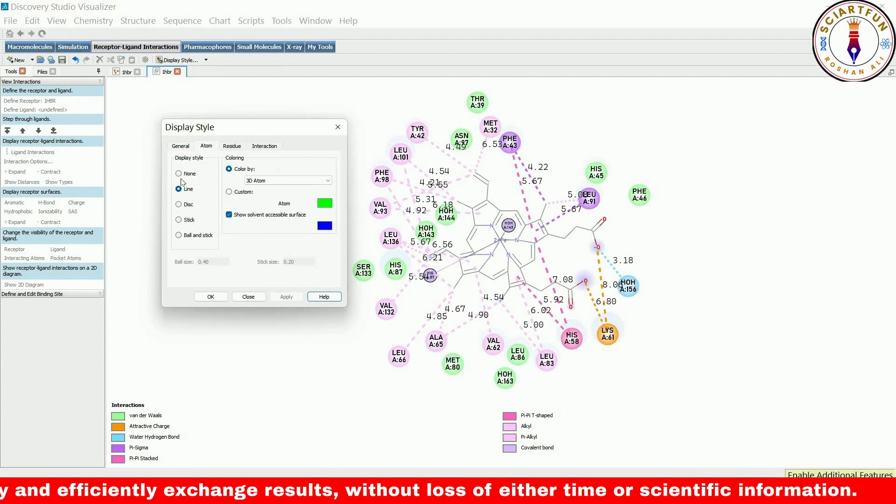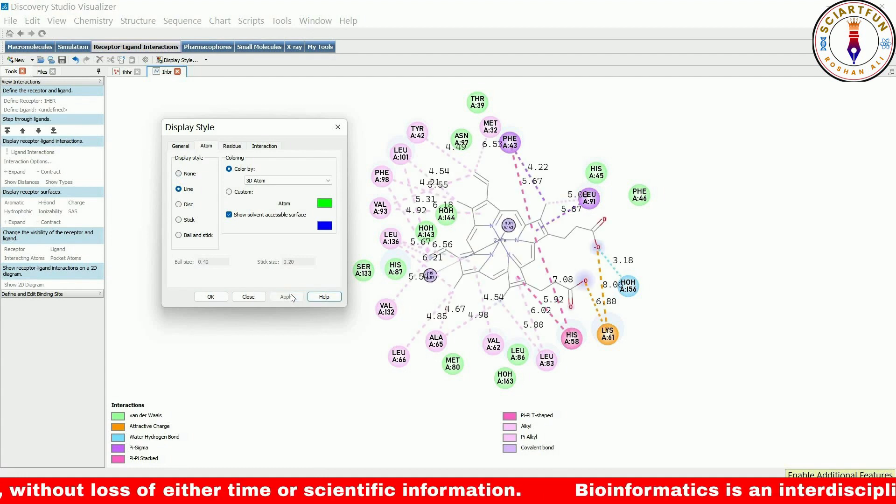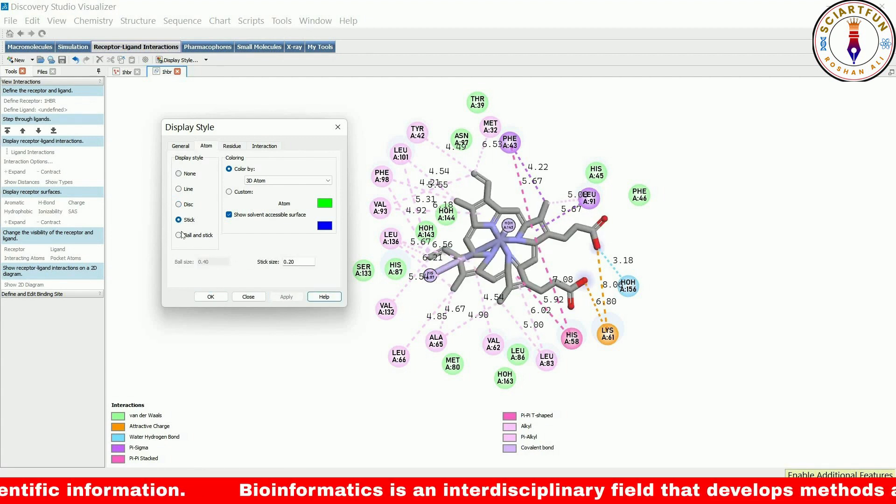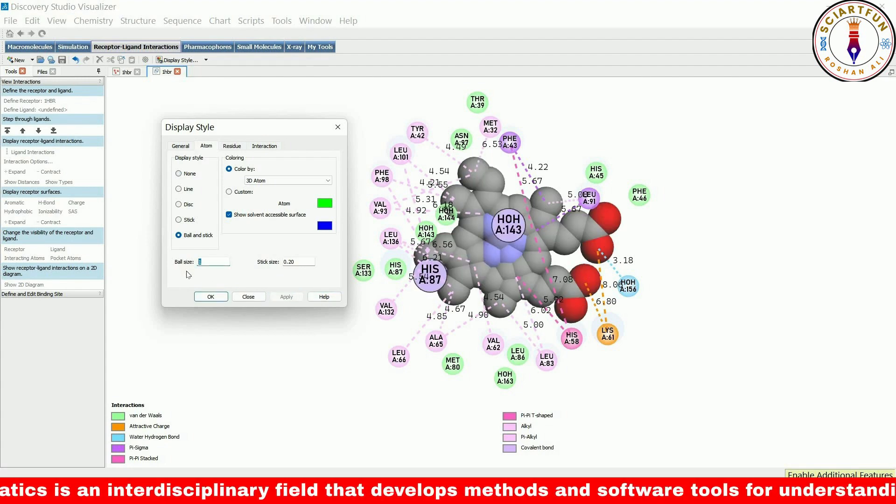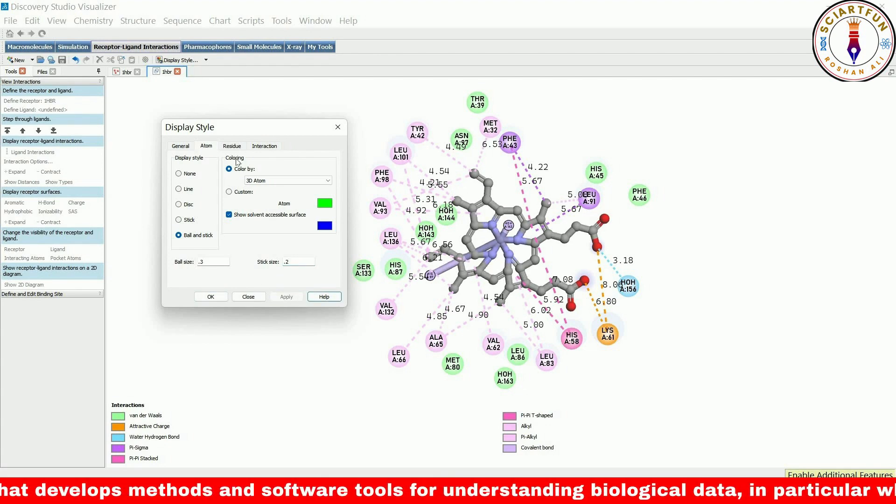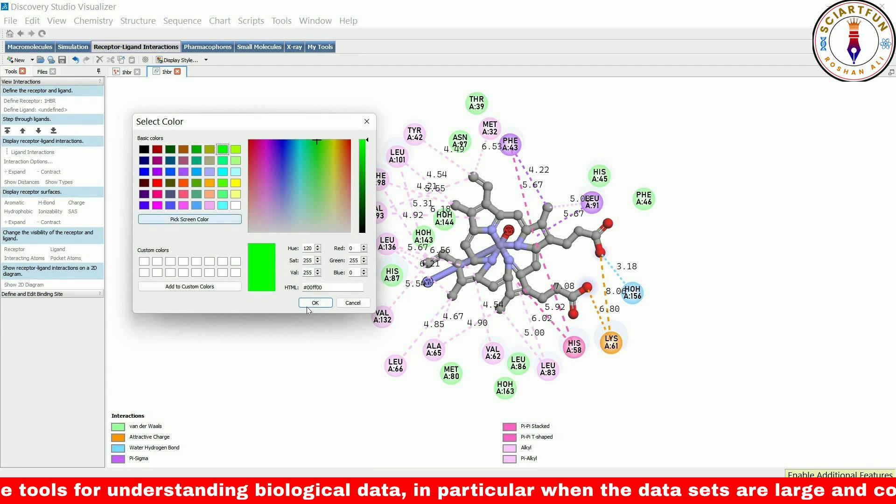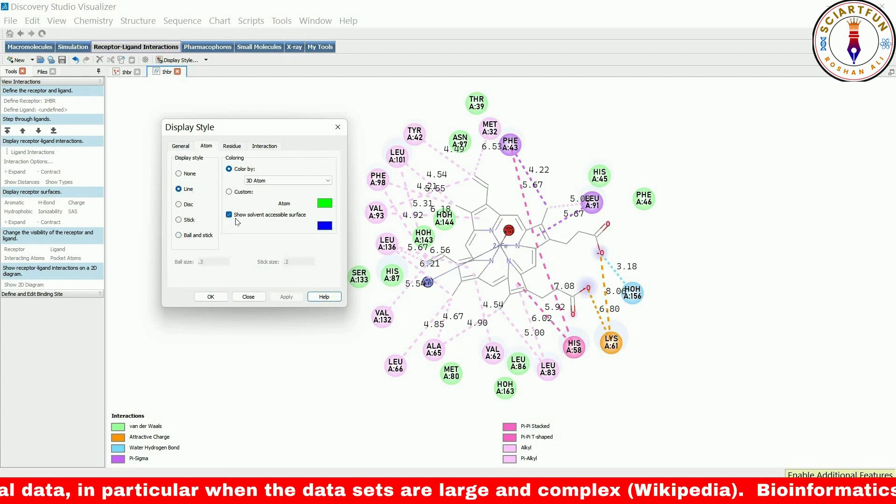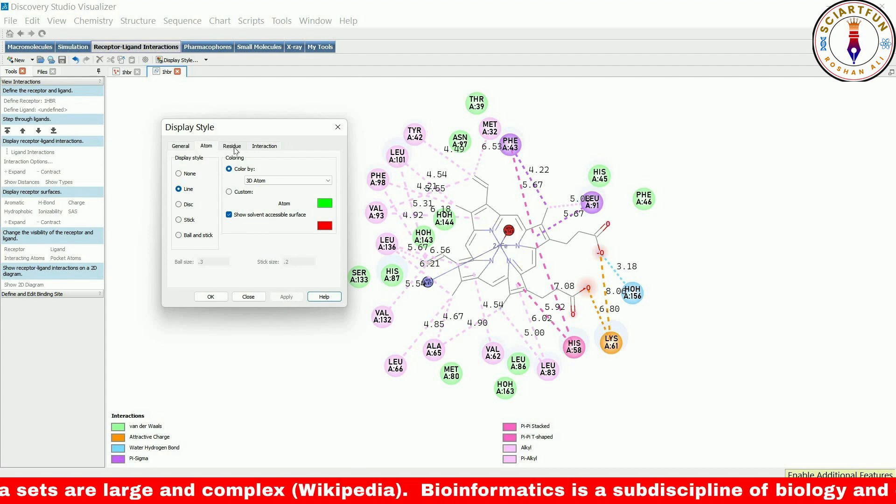In the atom tab, we can control the appearance of the ligand. We have the option to turn off the ligand display, display it as lines, as disks, as sticks, or bonds with sticks and atoms as balls. We can also change the ball size, the thickness of the bonds, and the color of the atoms.